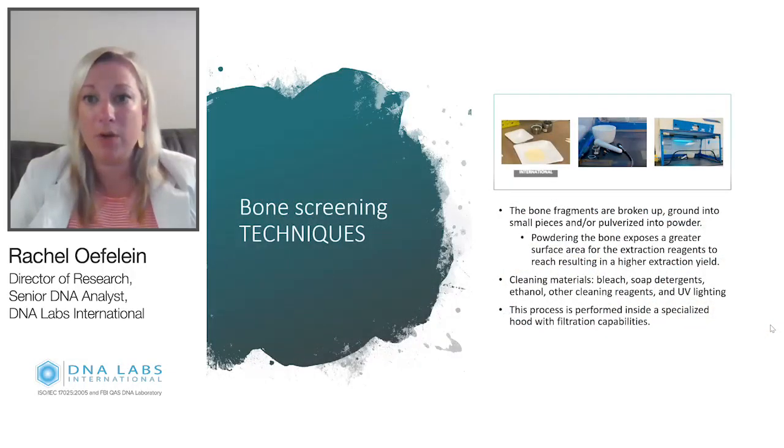So the bone fragments are broken up, and we do that in mortar and pestle and ground into smaller pieces or pulverized into powder. Powdering the bone exposes a greater surface area for the extraction reagents to reach, resulting in a higher extraction yield.